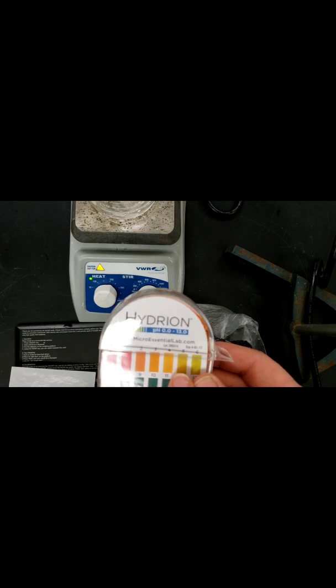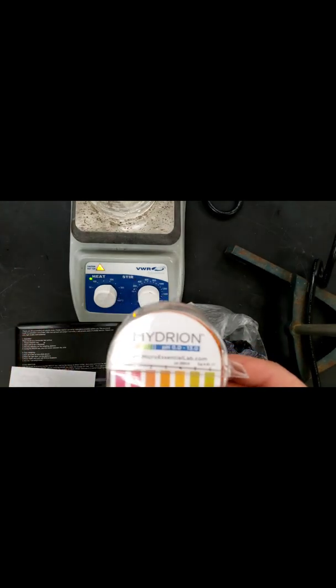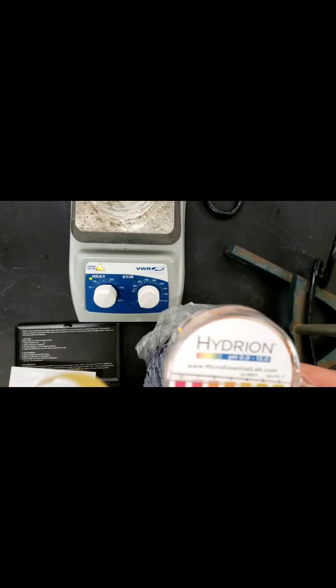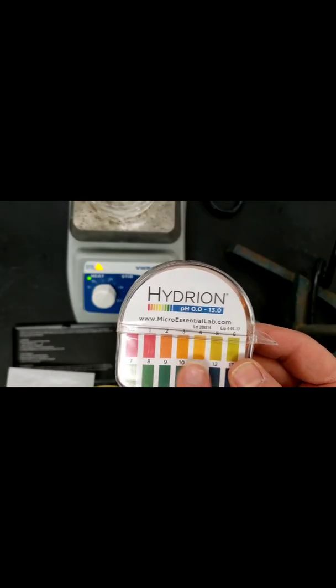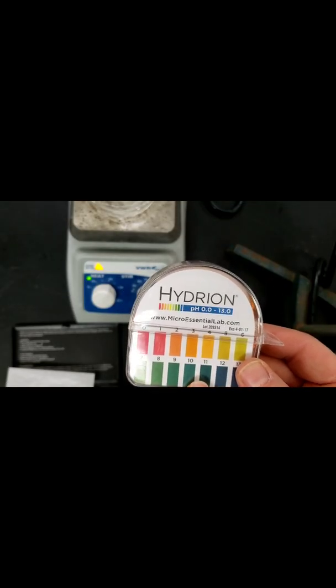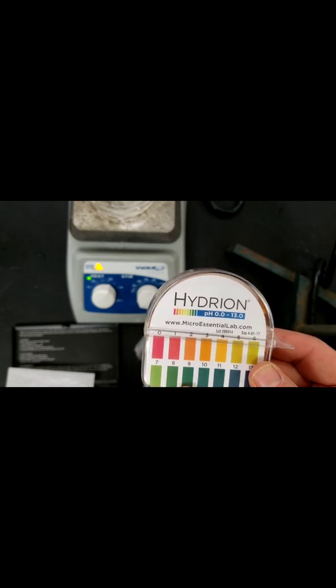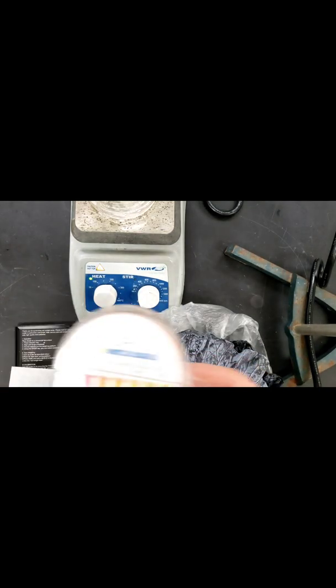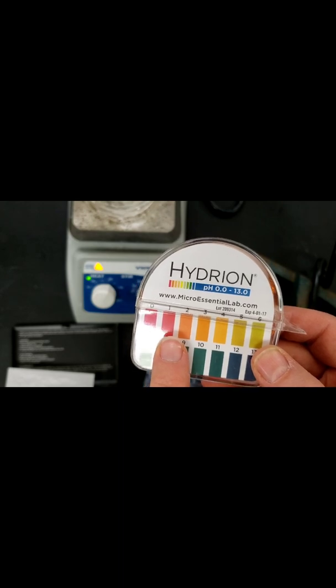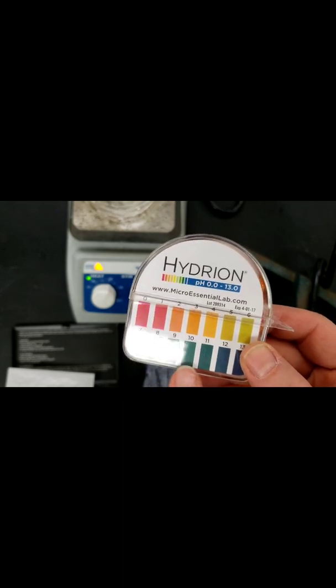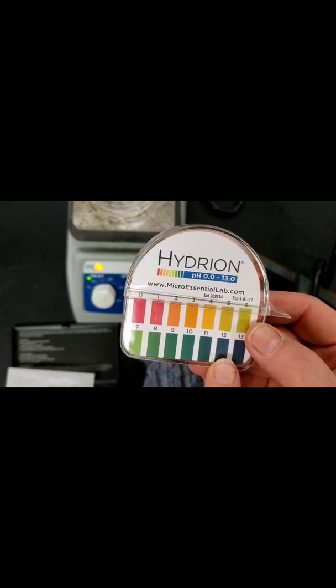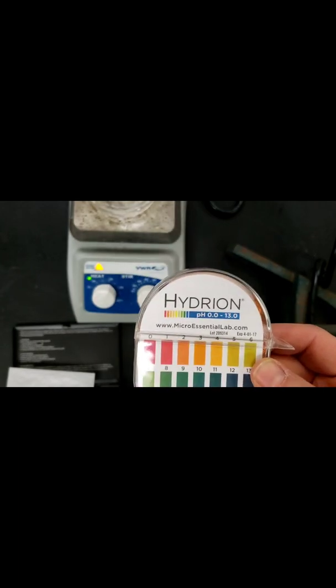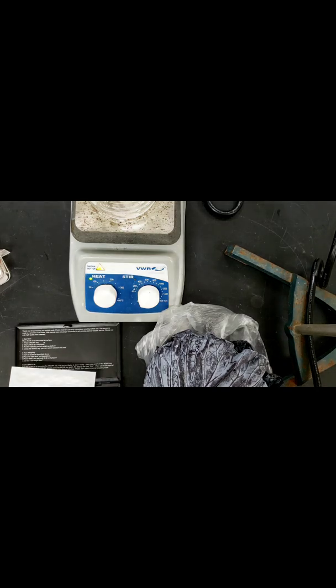This works because it has indicators that are absorbed into the paper and they change color based on the amount of hydronium ion concentration in the solution. The more hydronium ion concentration, the lower the pH. The more hydroxide concentration or less hydronium ion concentration, the higher the pH.